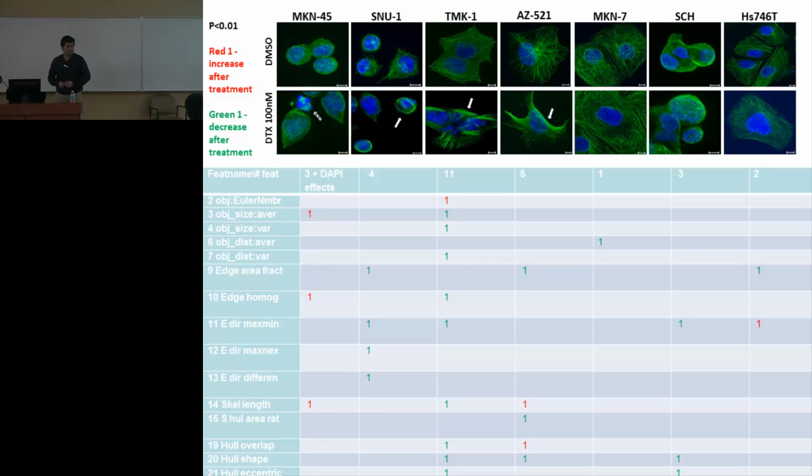What is blue in this? DAPI, the nucleus. So what we quantify here is only the green, the microtubules. But another thing to quantify in the next step is also the changes in the DAPI, in the blue, because the DNA also gets fragmented from treatment.